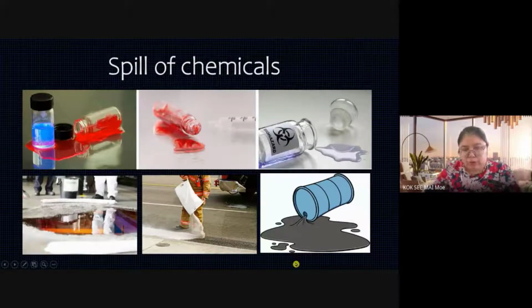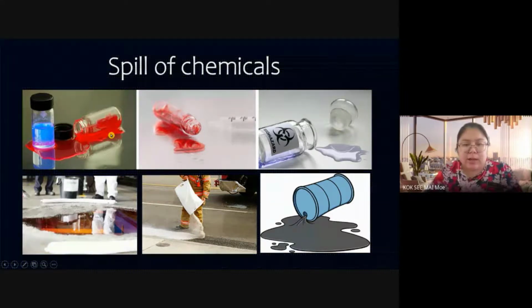Okay, now we go through to the spill of the chemical. Okay, if you spill, so what do we need to do? For example, you know the students, when they do like, suddenly you pull me, I pull you, then suddenly all these things spoil already. Now when it just comes out, if it's water it is okay lah. Never mind, using the cloth, then you can clean. But suddenly the acid you pulled out, then your friend kena the hand. So what happened? It pours out on the whole floor. So the ground is all toxic. Then we need to do something.